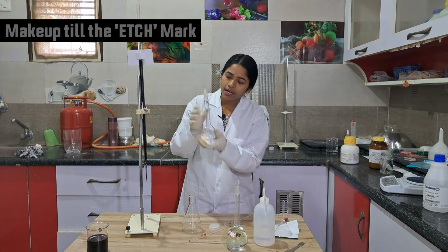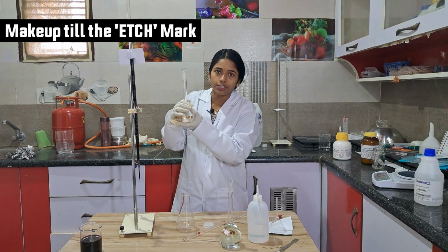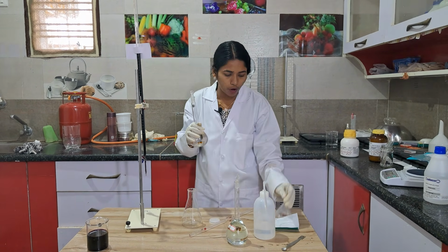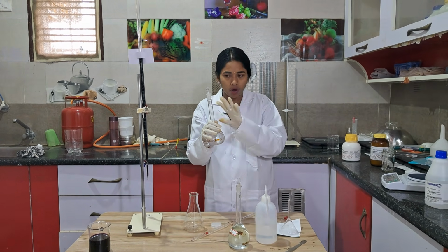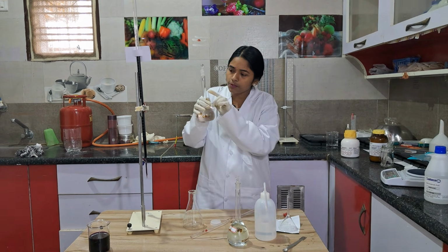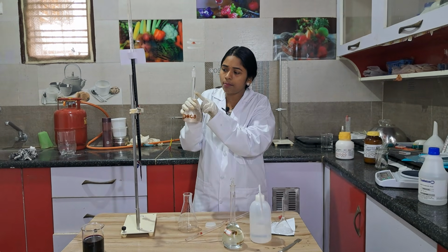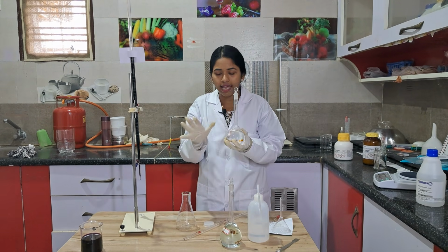After shaking, make up the solution clearly up to the mark. Here one mark is there, and you make up the solution below that mark. Clean the paper also, and wash the watch glass properly into this, so that any salt particles that stick also go into it. For the last drops, use a dropper and add slowly, drop by drop, so it comes exactly to this mark. Because it's a primary standard, it is very important that you prepare it exactly.